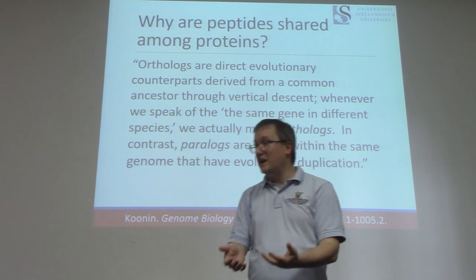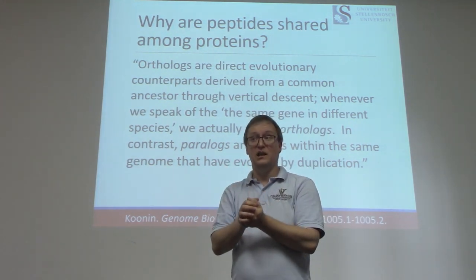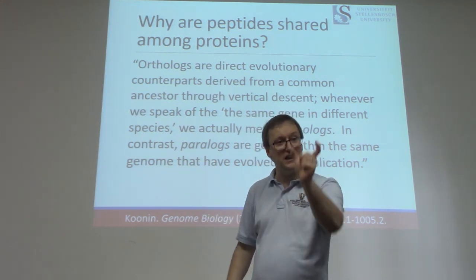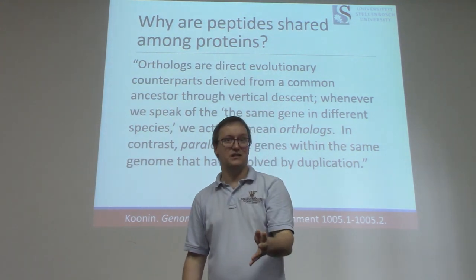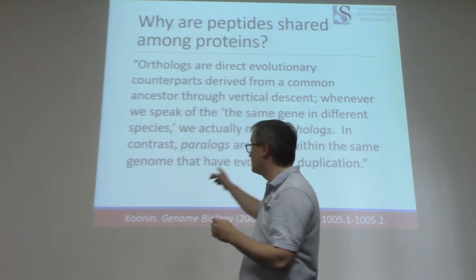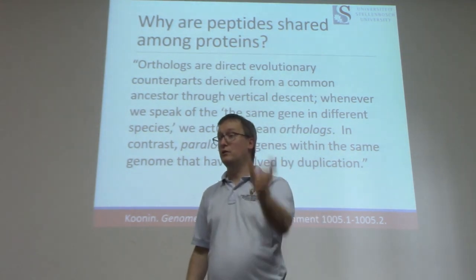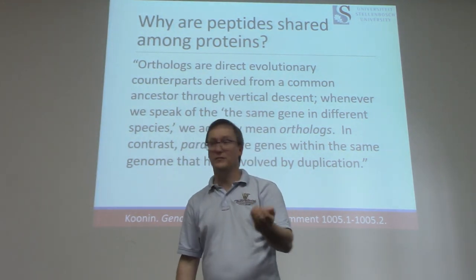We may try to identify proteins against a multi-species database. In a case like that, you're going to have to deal with orthology, meaning that an identified peptide could be explained by proteins from multiple species. Even if you're just dealing with a human protein database, it's still quite likely that an individual peptide maps to multiple gene duplicates, multiple paralogs.